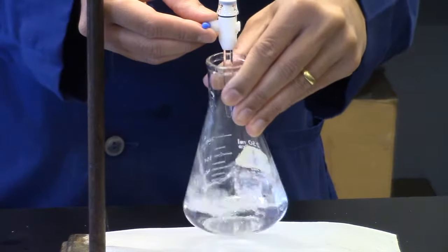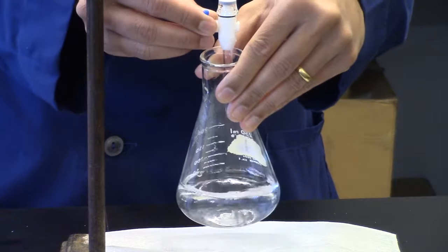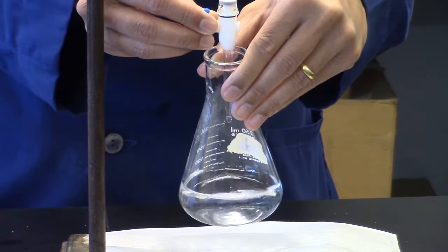When you start to see the pink color while adding sodium hydroxide, slow your rate of addition. The pink color will persist longer and require swirling.